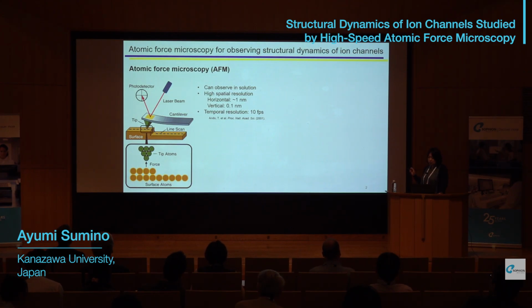Then by using the AFM, we can observe the surface structure of this sample in solution at room temperature. That means near physiological conditions, in buffer solution or something.